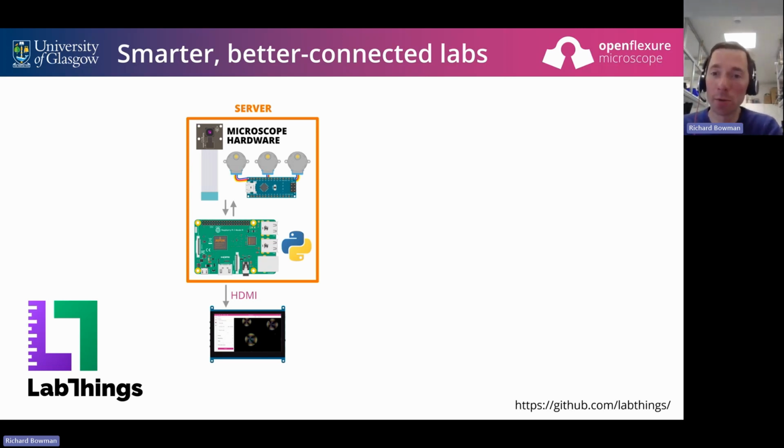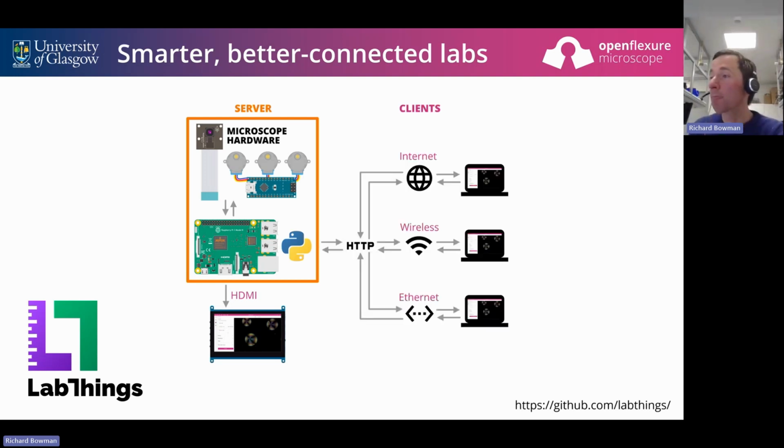Because either you have to build a phone into the bill of materials, which makes it quite expensive and provides a component that is very, very stealable, or you have to rely on people bringing a phone, which means you never know quite what phone you're going to get. And if you want to leave it running and doing a scan for 3 hours, well, when was the last time you didn't look at your phone for 3 hours? So the Raspberry Pi is a nice platform to work with.